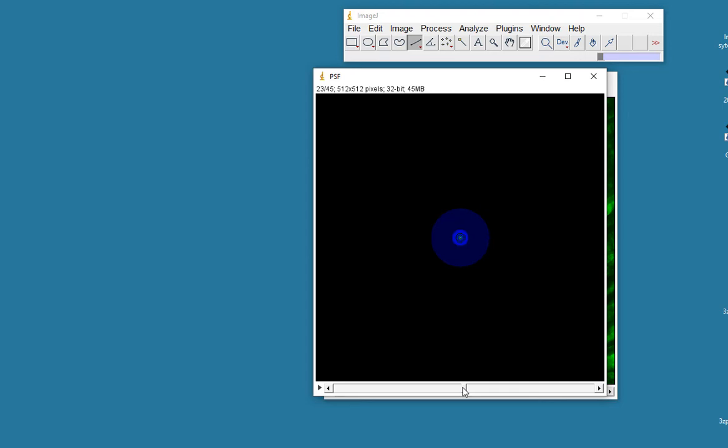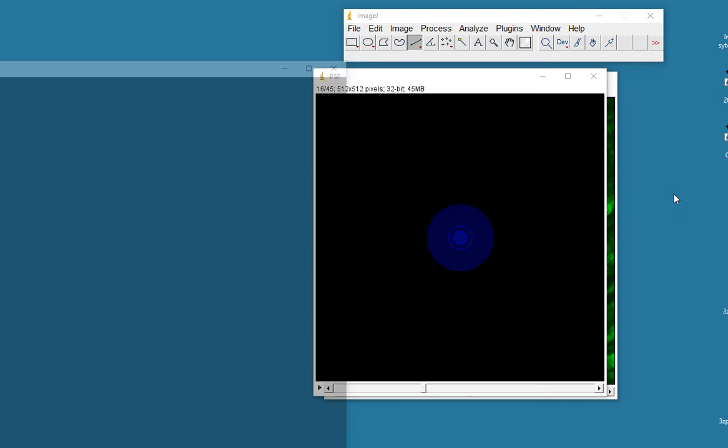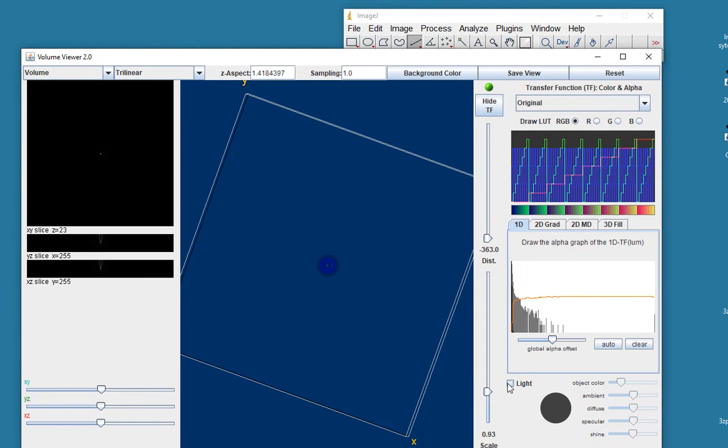We haven't measured it, and therefore, because it's an estimate, we refer to this as blind deconvolution. We don't actually know what the point spread function looks like. Just for a bit of fun, actually, you could take this point spread function, throw it into the volume viewer, and see what it looks like in 3D.